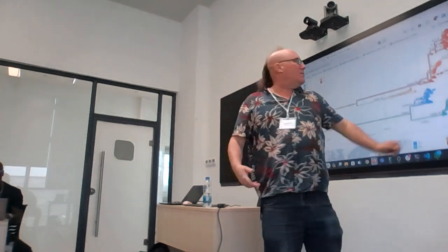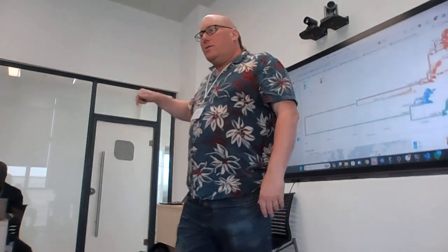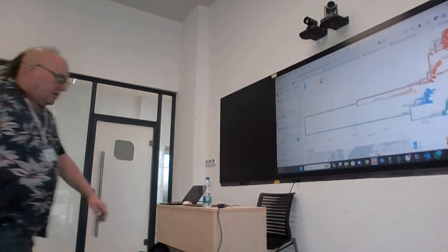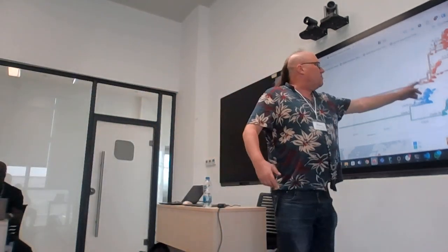So the reference that I used yesterday, the closest reference in Nextclade to what I had, was B1, the start of the B1 clade over here. Okay? But now I wanted to see, and the thing is that my consensus only had one mutation compared to B1, remember? So I'm now going back, and I've chosen the start of clade 2B as my reference, okay?